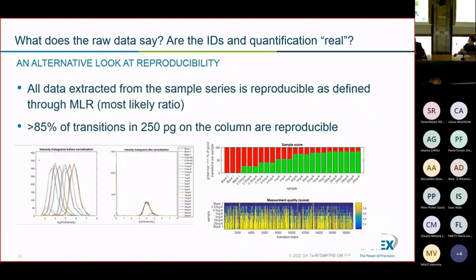Just a final comment, and with this I conclude, is to say that there are different ways to report reproducibility. One of them is to report averages. Remember, averages are not the same, and I'm not going to guarantee that your protein is actually reproducible.